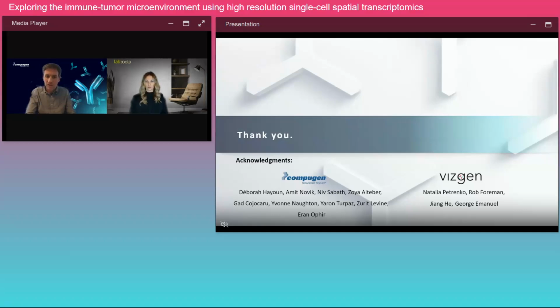It's something that's very challenging to do because you have different cell types of different shapes, and you have different aspects of the tissue that make this hard. But basically, there have been advances that have become available over the years. So we started this project about 3 years ago, and back at the time, it was pretty hard to do this. And in the initial versions of the segmentation we obtained, it really was a challenge. We saw a lot of oddly shaped cells that don't make sense biologically, and we had to develop our own code to screen these polygons and to make sure these are indeed cells. And it was a true challenge.